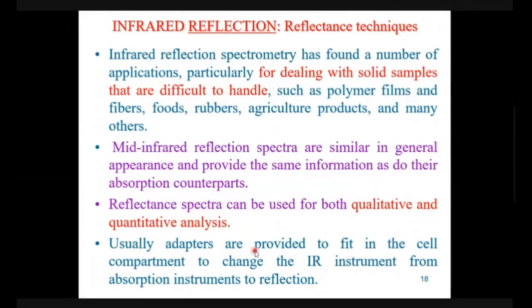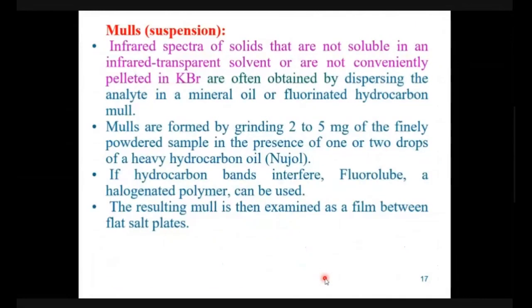Usually adapters are provided to fit in the cell compartment to change the IR instrument from absorption to reflectance. Now these adapters, I will try to show you at the end of lecture through video, because in previous lecture I tried to play the video but that was not working. So I will finish the theory today and then I will show you the video if time permits. Otherwise, I will simply provide you the links.